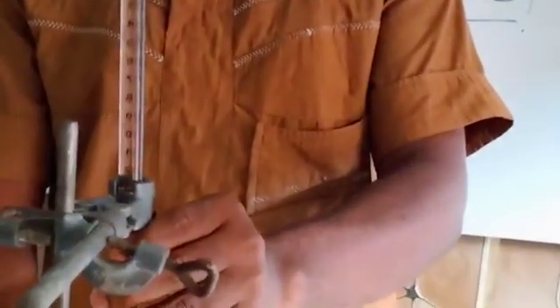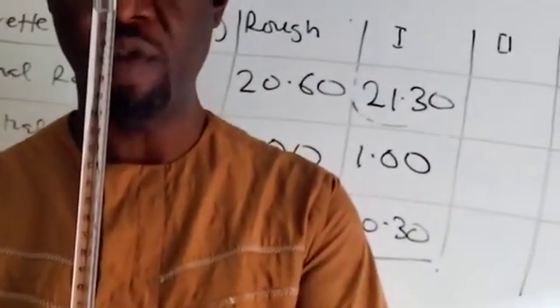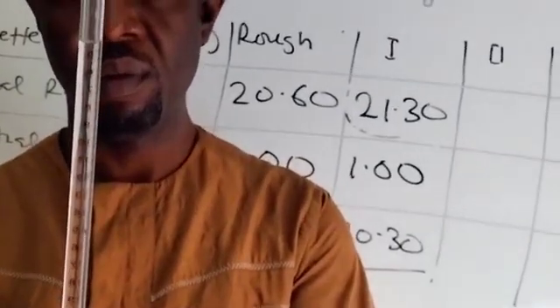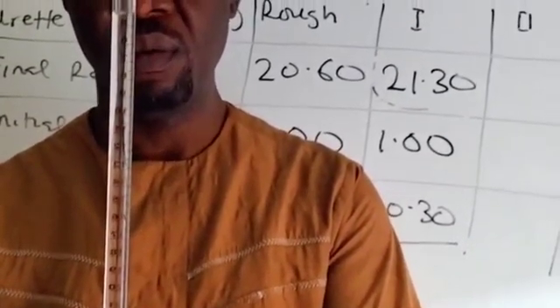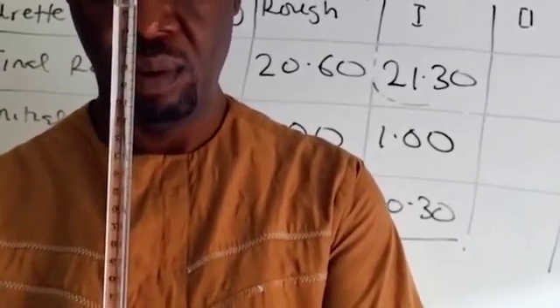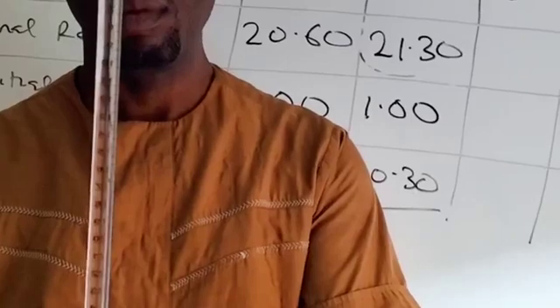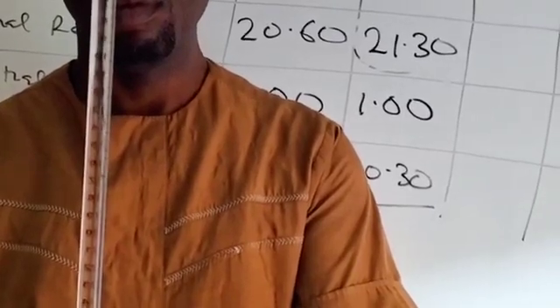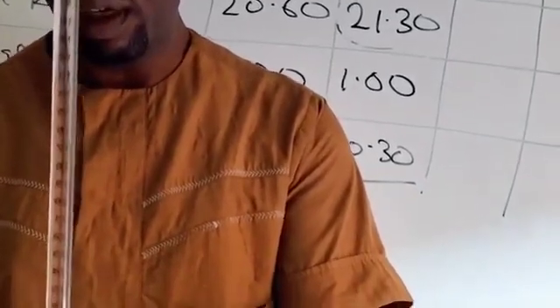The bottom of the curve you're seeing, the concave shape, sits on the mark for 5. It's going gradually. So here we are at 5.